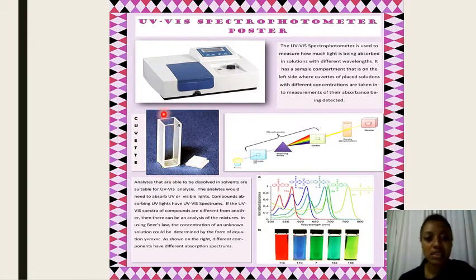While placing the cuvettes into the sample compartment, our lab instructor told us during our lab experiment that we are supposed to hold the cuvettes by their frosted sides. This is to avoid fingerprints, scratches or drop marks. Also, before placing the cuvettes in the sample compartment area, they are to be wiped carefully with a Kim wipe or a clean tissue paper.